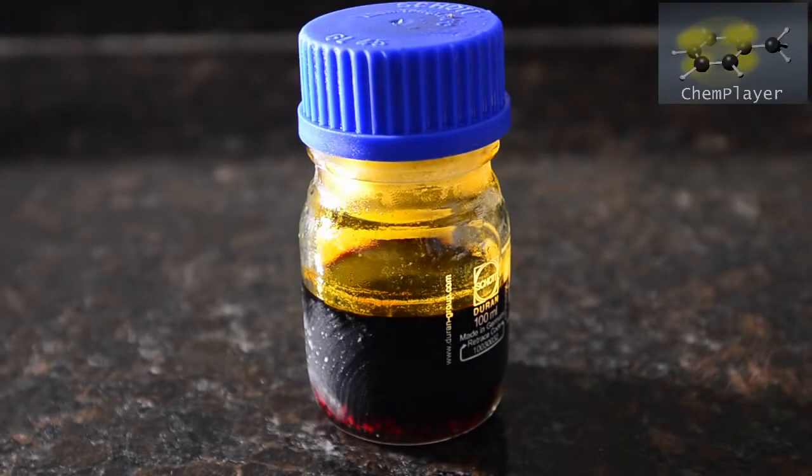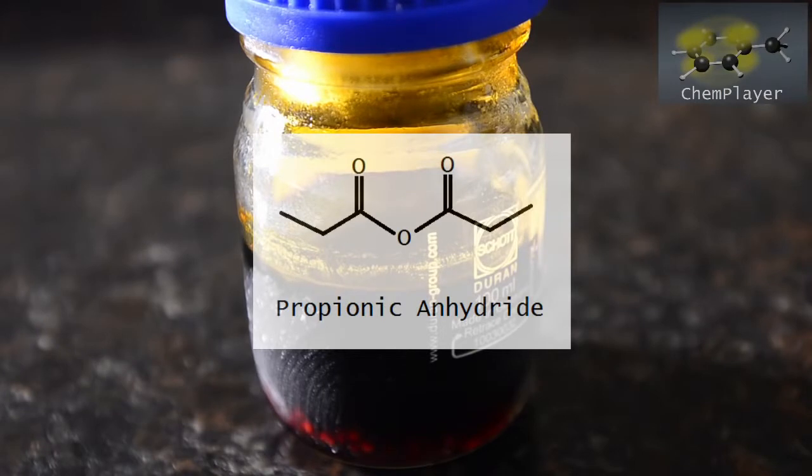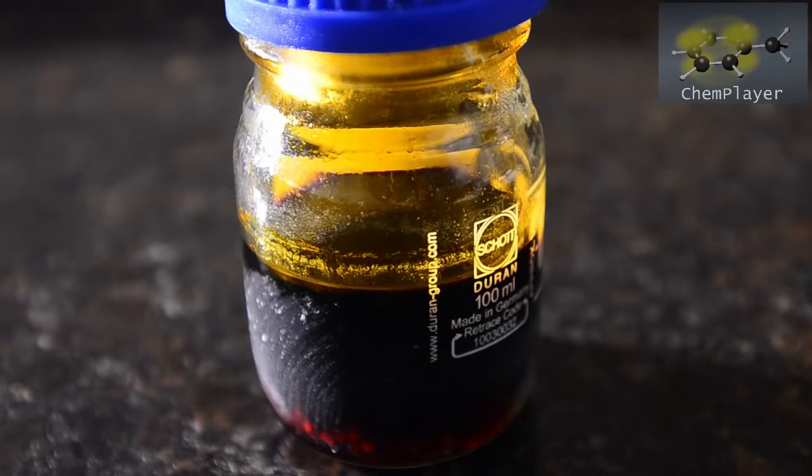Today we're going to test out two different preparations for propionic anhydride. In the previous video we showed you how to make a solution of elemental bromine in dichloromethane. We're going to use this in our first experiment today. We store ours in deep freeze together with calcium chloride to keep it dry.